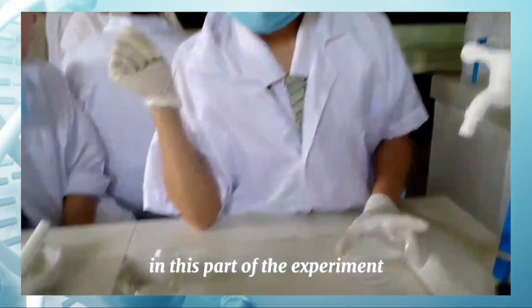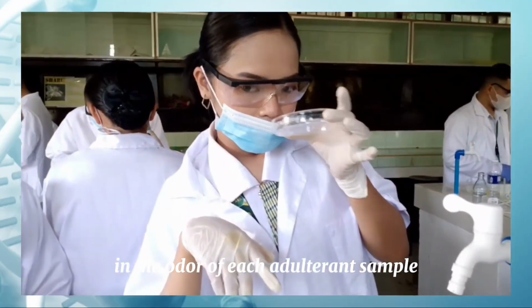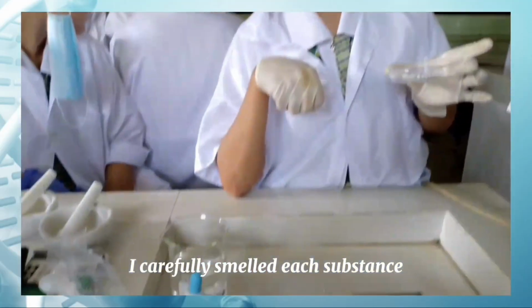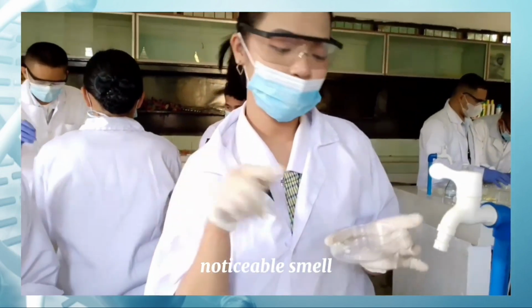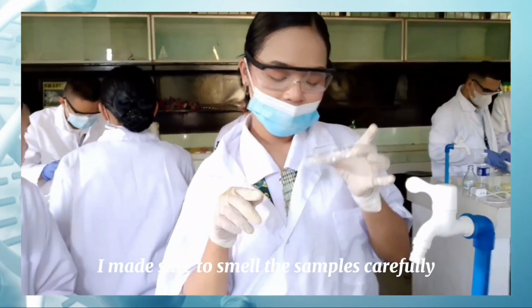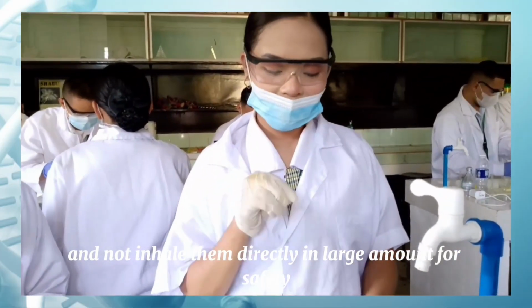In this part of the experiment, I tried to observe if there were any differences in the odor of each adulterant sample. I carefully smelled each substance one by one to identify whether they had a distinct or noticeable smell. While doing this step, I made sure to smell the samples carefully and not inhale them directly in large amounts, for safety.